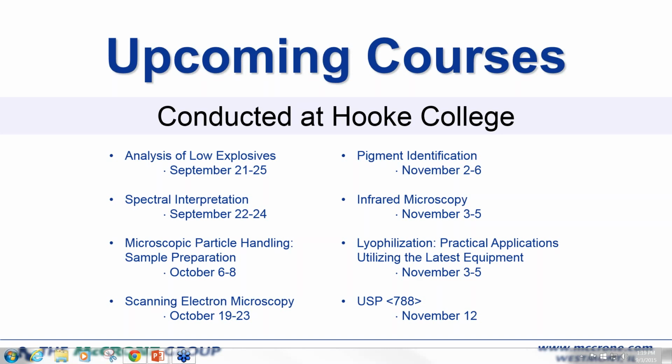Okay, thanks, Mary. Okay, a question from Harrent. How would you handle spectra that contain tertiary or quaternary components? For example, if the liquid was a viscous medium that contained the samples?